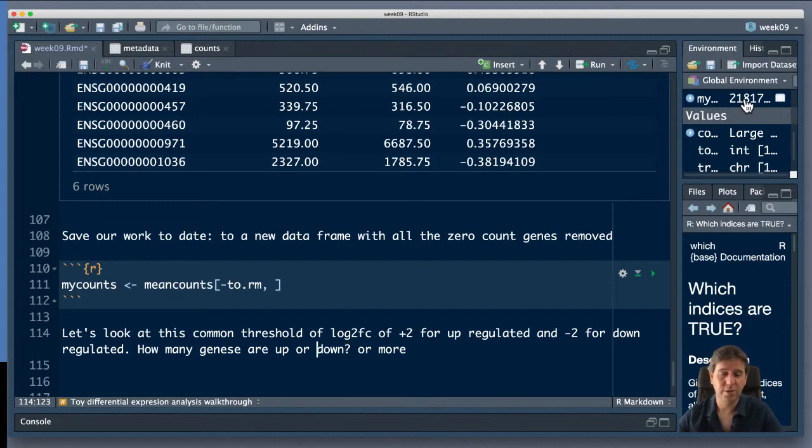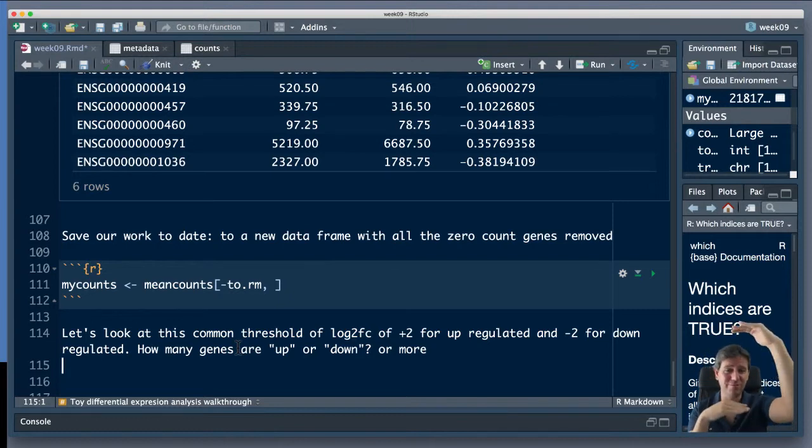And you can put these in this up and down in quotes. Obviously, we're missing a step where my inner statistician is screaming at me, right? Because we've got a difference in the means, doesn't mean that these are really, it could be changing a huge amount. Whenever you add the drug, the expression could be all over the map. It could be all over the place, and then when you treat it, it could be just down here, right? It doesn't mean it's a significant difference, right? But let's go with it anyway for now.